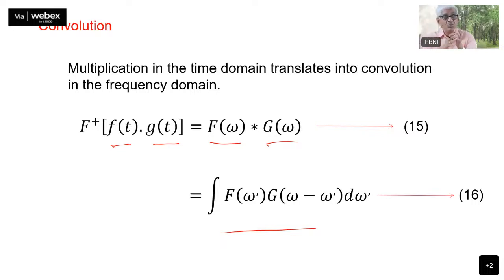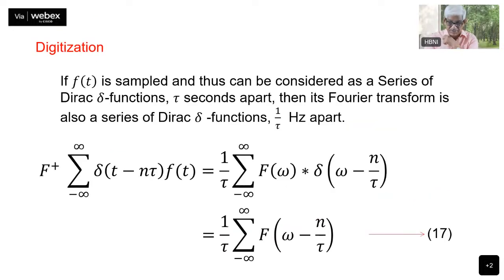Therefore, it is easier to do this operation in the time domain. You need to do this to smoothen your data, and the convolution essentially helps you make a better looking spectrum. That is easily done in the time domain because convolution in the frequency domain is like the multiplication of the two time domain functions.